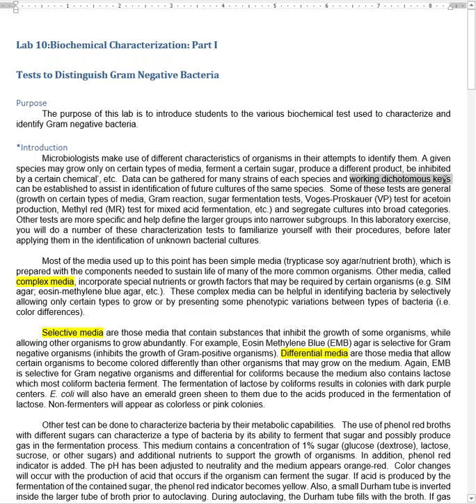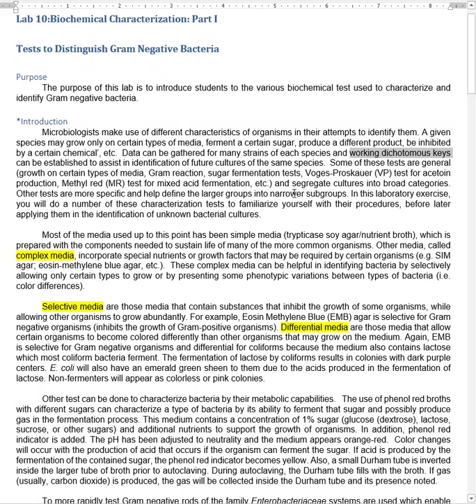They call these guys working dichotomous keys. What does that mean? It's a big long word. It's basically a list that tells you the test results for all the bacteria by species. So if you get a certain result, you can either say that's exactly which bacteria, or you can say, well, now we need to do this other test. So we'll talk all about these as we go through them, and I can give you some insight on some of these.